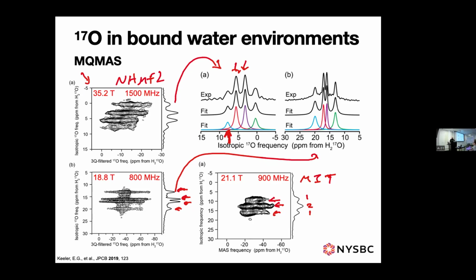I don't believe this one is that, this is the new series hybrid magnet. So you can only acquire spectra in like 8 hours. I think they can turn it on for a couple of days if you really need it, but it's not that. Their 800 was some of the first spectra that were taken on that magnet.